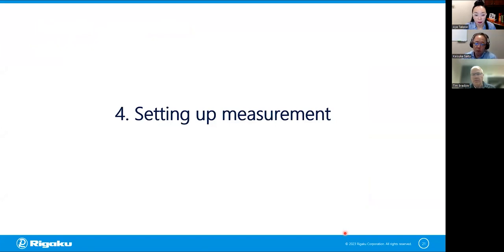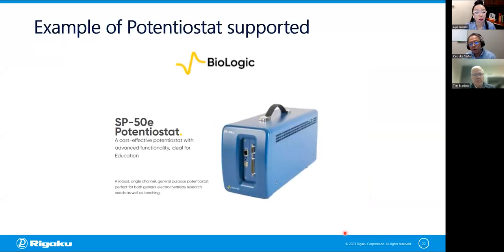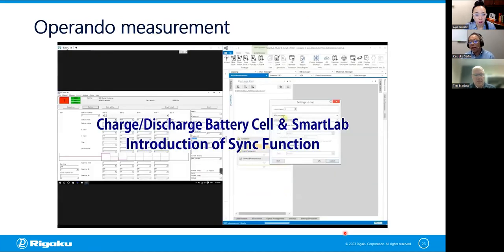So section number 4. In this section, I'm going to discuss how to set up a potentiostat and XRD instrument, just to synchronize between them and how to start the measurement. By default, in our case, we do support BioLogic potentiostat. This means if you have a BioLogic product, you don't need any modification in terms of our software or hardware.